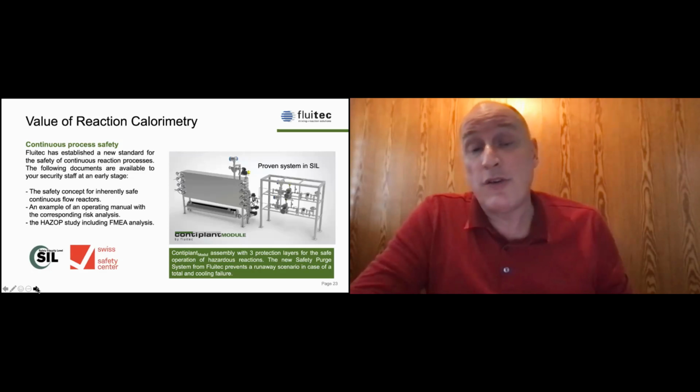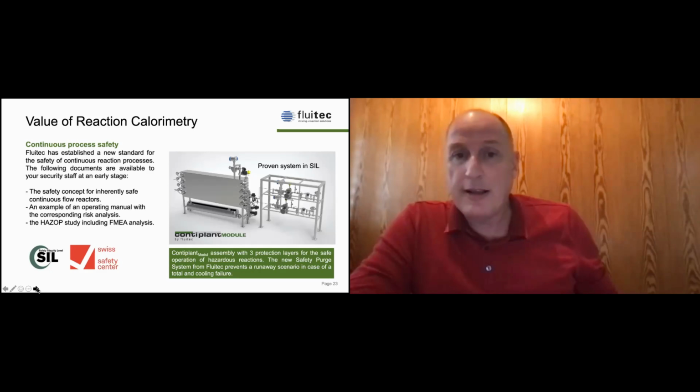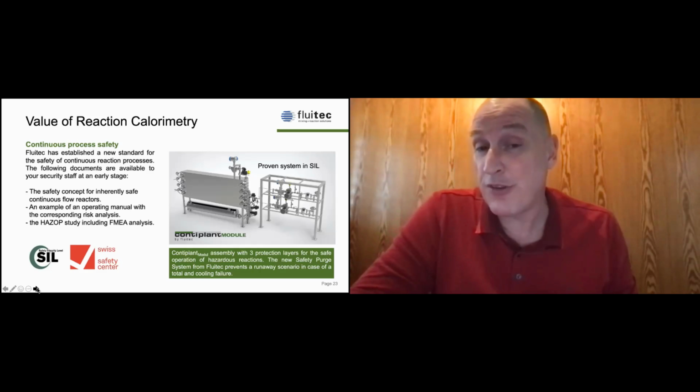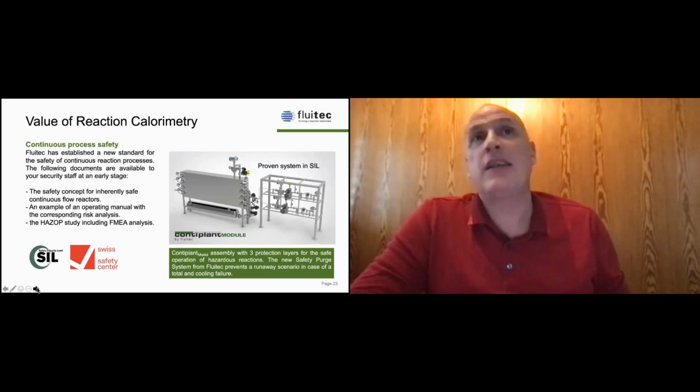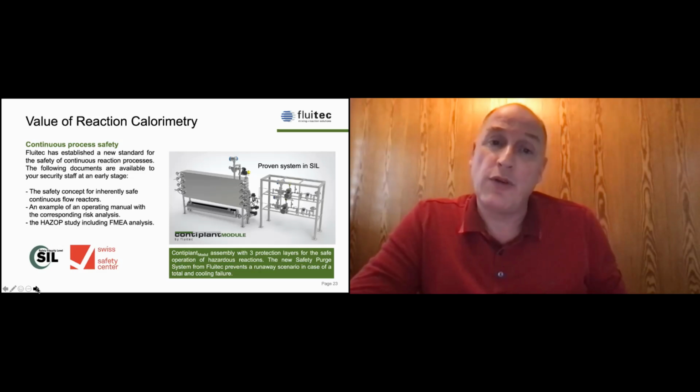Another thing which is also interesting is that if you invest into a reaction calorimeter, you already have the control system for the scale up, because we decided that we are using industrial equipment also for the reaction calorimeter and no lab equipment. So the control system is programmed.